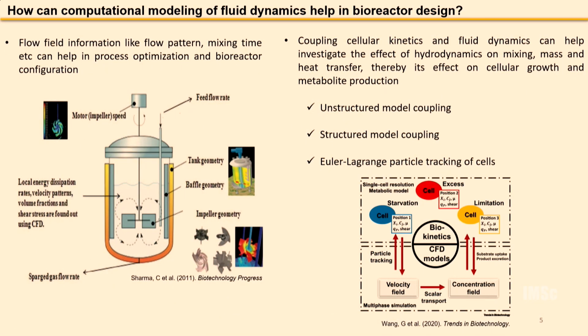So with respect to bioreactor design, we can actually get information like mixing time, the flow patterns and different bioreactor design aspects such as the impeller design, sparger design, and with respect to the operating parameters such as the impeller speed and so on. Apart from that, there are also aspects where coupling the kinetics of the cell with the fluid dynamics can help us investigate the effect of hydrodynamics on the mixing and mass transfer.